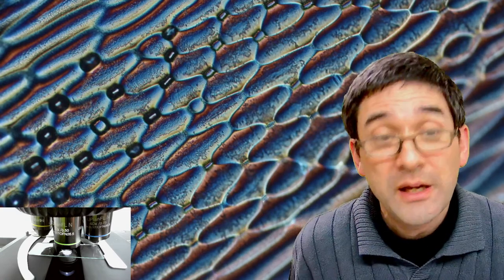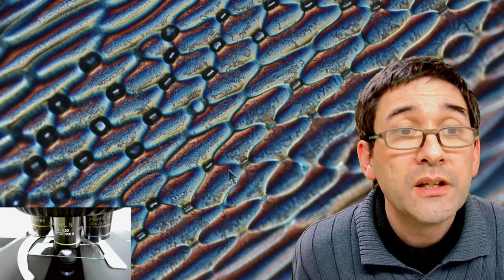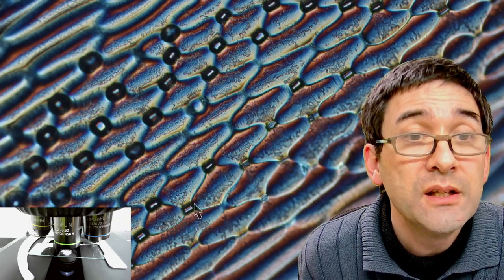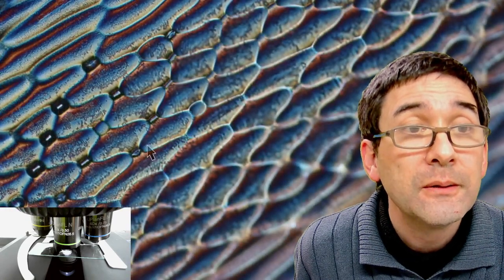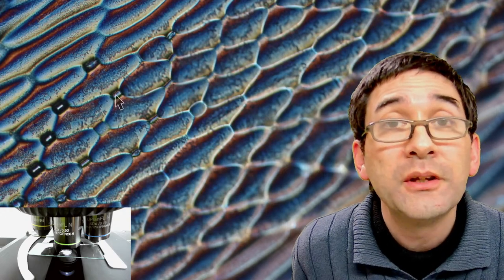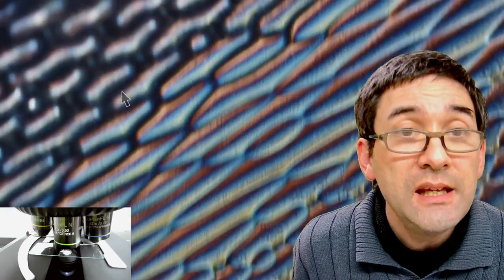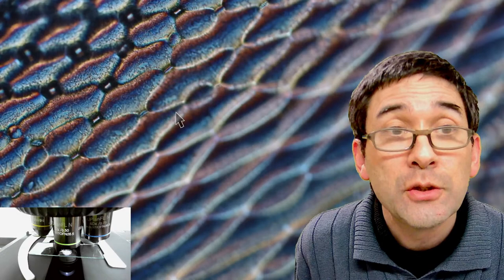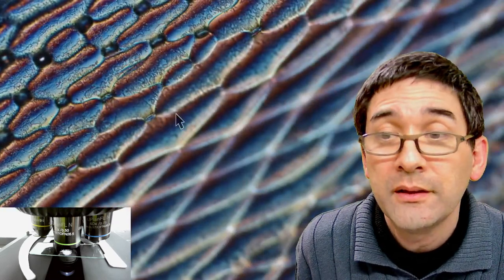There are a couple of interesting things we're able to see here. I'm going to explain this because it's quite nice that you're able to see so many structures on the glue. This is the surface of the leaf — not the cells themselves but the surface. You see the individual cells here, and then some interesting little openings — these appear to be the so-called stomata or stomates. These are openings in the leaf which allow gases like carbon dioxide to enter the leaf.